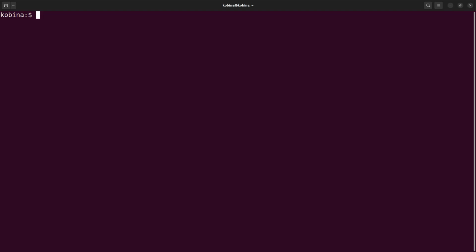First of all, we are going to open our terminal, which we have done, and we are going to cd to our home directory. Then we are going to create a working directory. This is where we are going to work in. So I will say mkdir merge_snps_indels, because that is what we are going to do. Then I'm going to cd into that directory. Nice. Now what we need to do next is to get the example data.